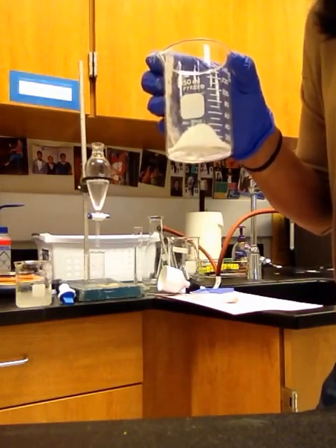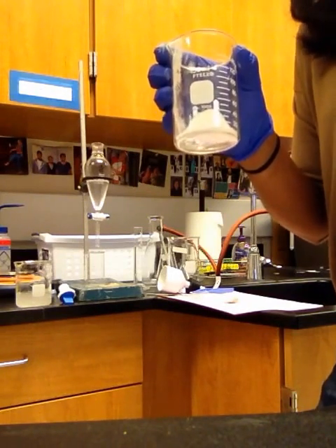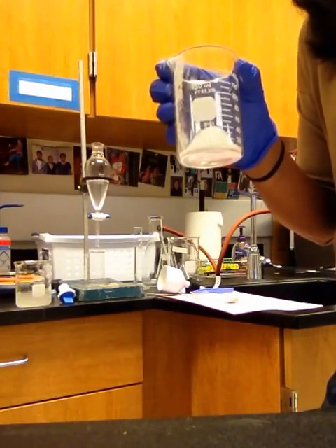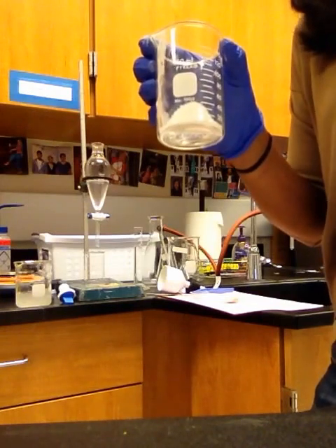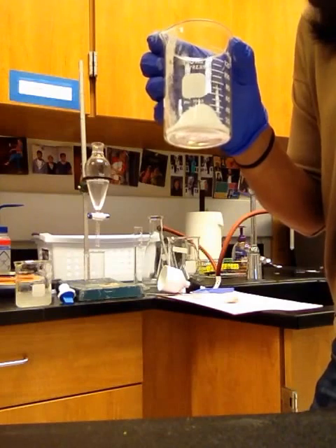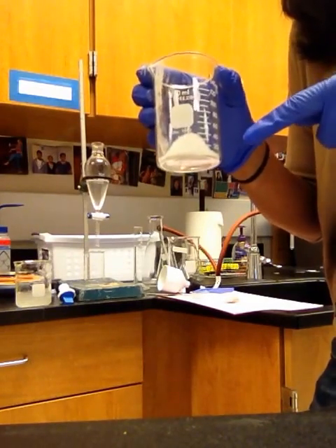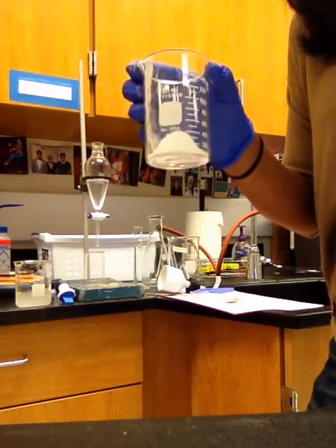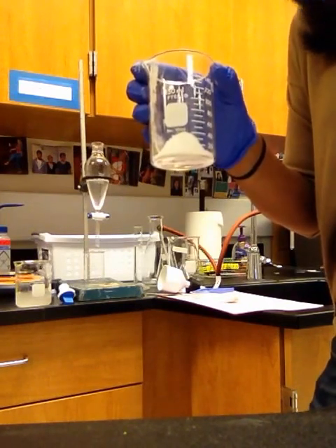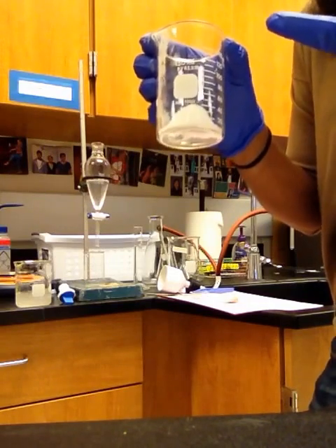Remember, the idea here is to figure out why these pills are being chipped. Is it that the binder ratio is off, or is it that there is a contaminant, aspirin, acetylsalicylic acid, present in the sample? For accomplishing this, we'll take this sample and try to separate out the 3 components, which is the binder, acetaminophen, which is the active ingredient, and ASA, which is the contaminant if it is there.